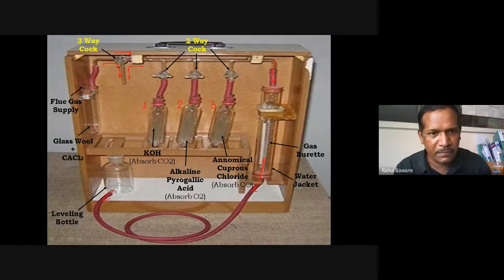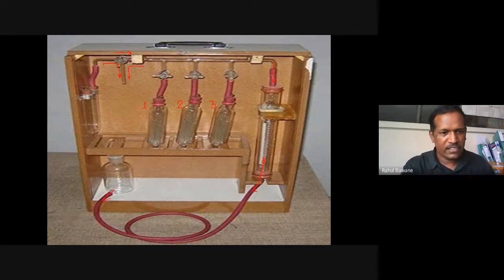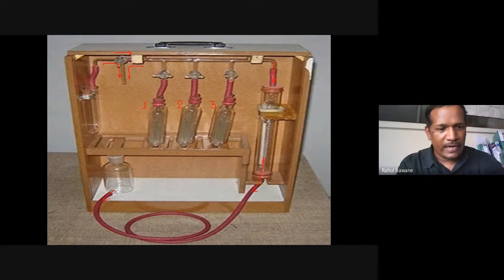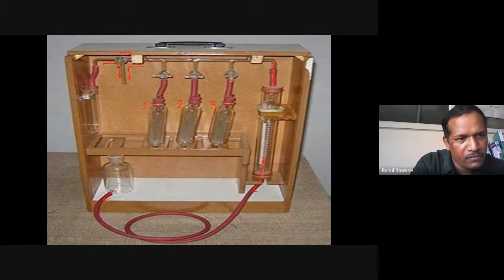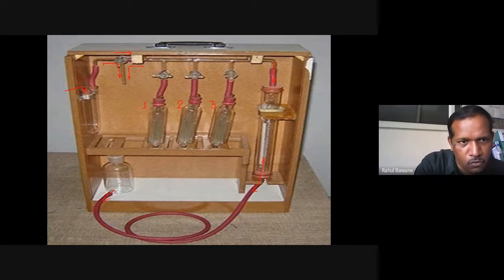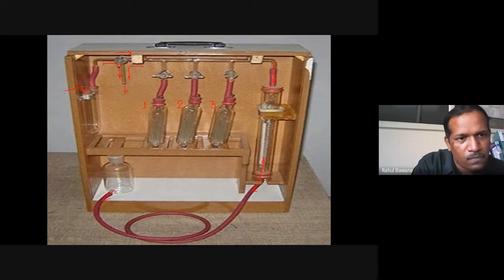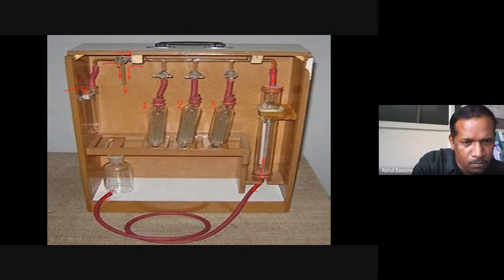During the experiment, if I raise the leveling bottle, water starts moving and enters the gas burette — the gas burette fills with water. To start the experiment, we attach the flue gas supply to the U-tube but do not allow it to pass through the whole system initially. We open the three-way cock and allow whatever air is on the right-hand side to move out.